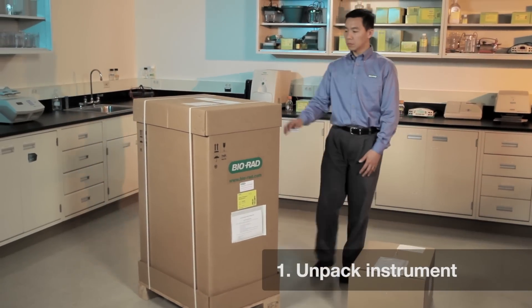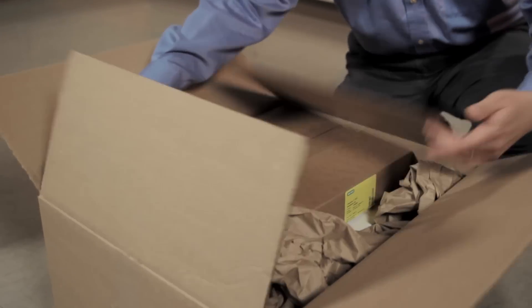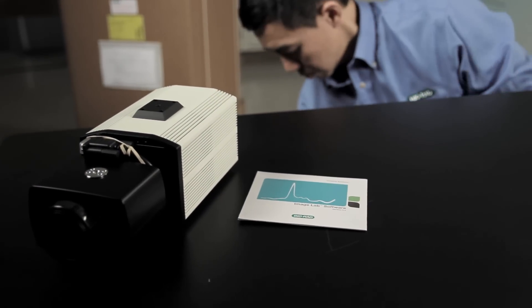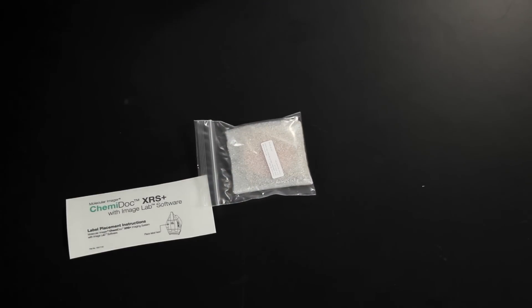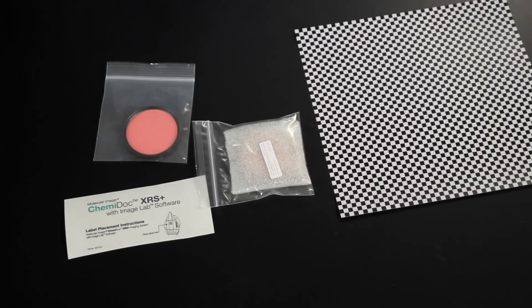First, unpack the system and identify all the components. In the smaller box you will find the camera, ImageLab Software CD, Imaging Test Targets, and Installation Kit. The installation kit has the ChemiDoc sticker, standard filter, flat fielding disk, and focus calibration targets.